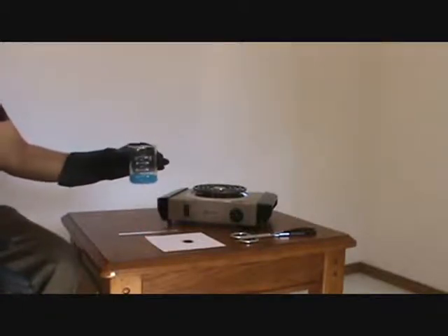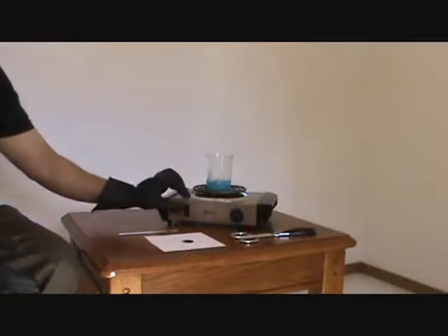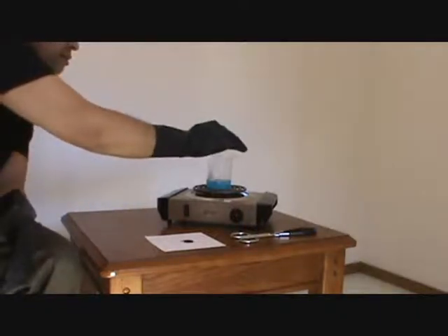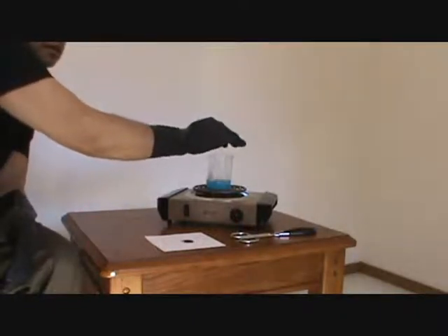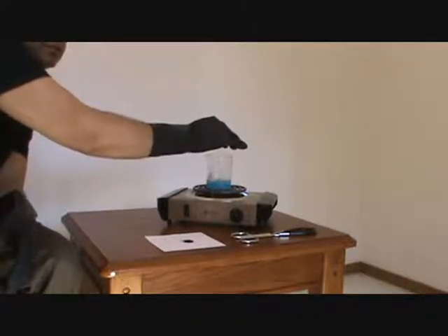Now I will heat the beaker and its contents on this hot plate. I will not boil the solution, and I will stir with a glass rod to help dissolve the copper sulfate. After all of the copper sulfate is dissolved, I will remove the beaker from the heat.